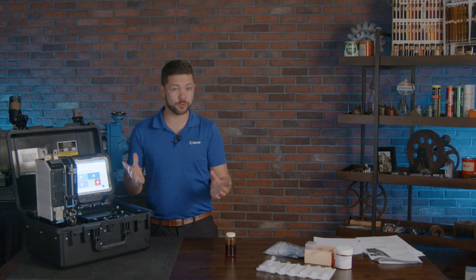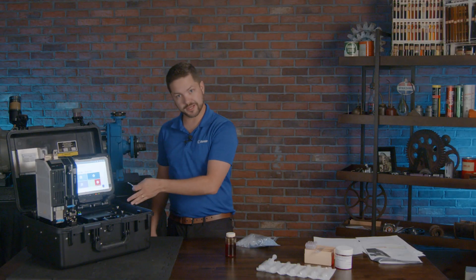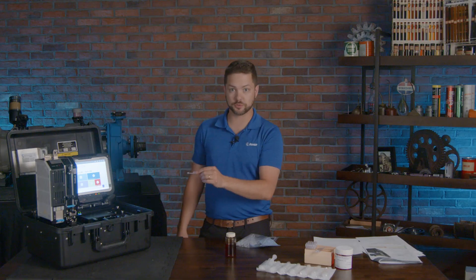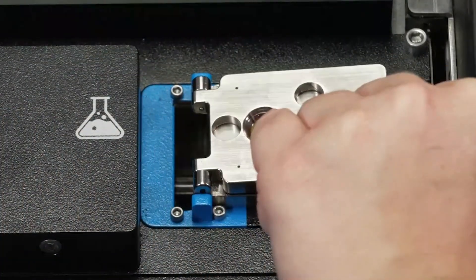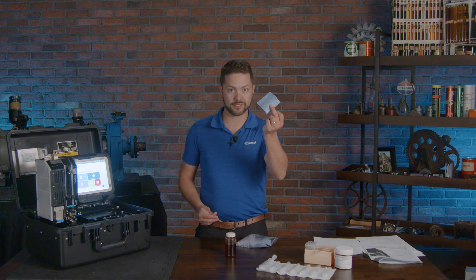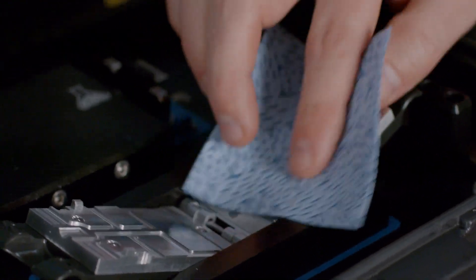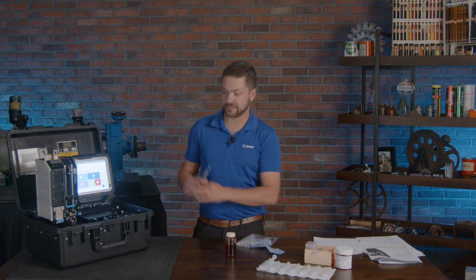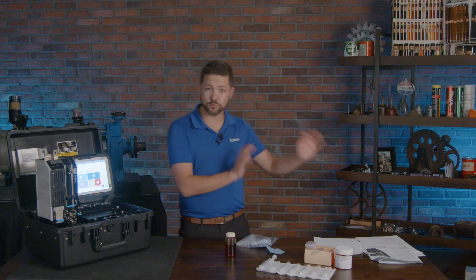We took an oil sample and need to run it through the lab. This field lab lets you do it quickly — about 10 minutes — and comes with a few things. One thing you'll need is a little pipette. This is important for the Fluid Scan and the Mini-Visc — you just add a drop or two of oil for each one. Once you add the drop, it runs the test, and when you're done you clean it off with a little cloth — no big deal. It all takes about a minute or so. Same thing with the Mini-Visc. Both follow ASTM procedures, ensuring accuracy just like a commercial laboratory.